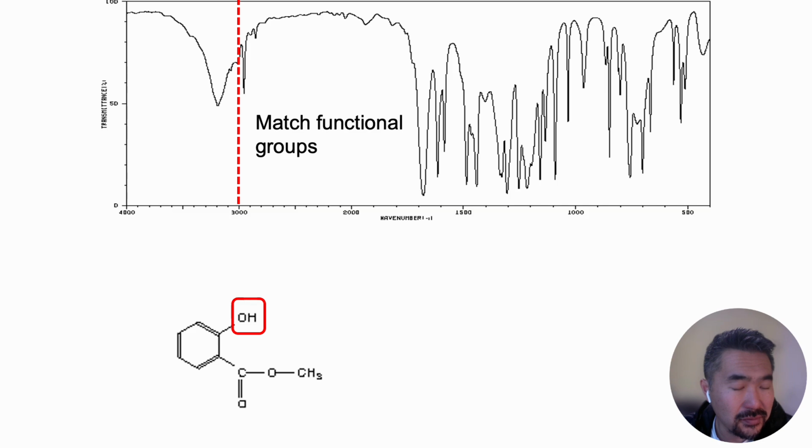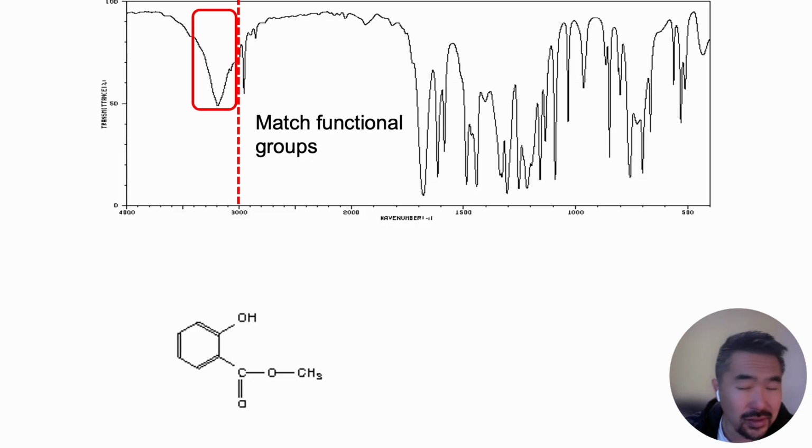And then, of course, we have this OH group, which is not a typical alcohol because this alcohol is very acidic, kind of like a carboxylic acid. But nonetheless, it's a fairly regular-ish OH group. And so this shows up around usually 3300. This is showing up around 3200.